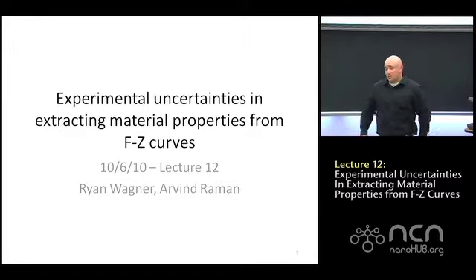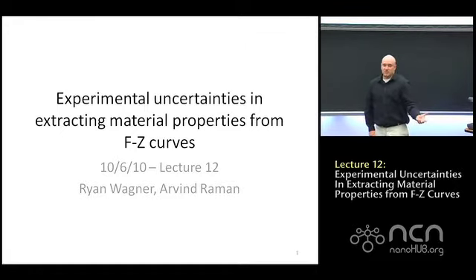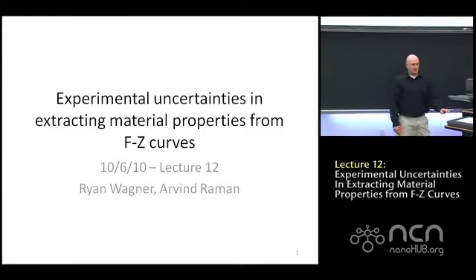So what I'm going to run you through today is to go over how to extract elasticity from a FZ curve. And then I'm going to talk about the uncertainty associated with doing that. And hopefully I'll show you a bit of a case study of some of the work I've done to try to highlight why this is important and what sort of bounds you can expect from this process.